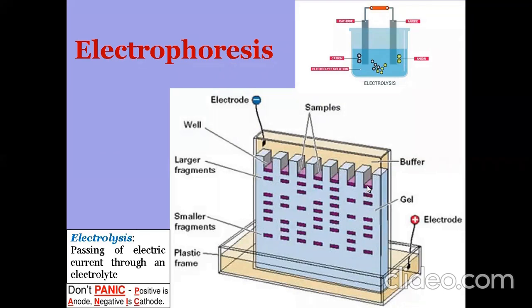If you can see, sample number 1 has multiple bands, so it has multiple sizes of protein. If this is protein, there are multiple size proteins. A more important thing we can do is compare these two samples, which means this sample has different proteins than this sample. You can see this protein is the same. It looks like these three share it: this sample, and this one.